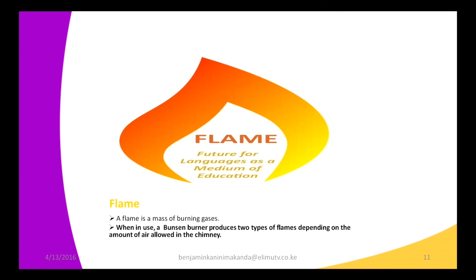Now, still on the flames, when in use, a Bunsen burner produces two types of flames, depending on the amount of air allowed in the chimney. You realize that a Bunsen burner has an air hole that regulates the amount of air getting into the chimney to mix with the laboratory gas so that combustion can take place.